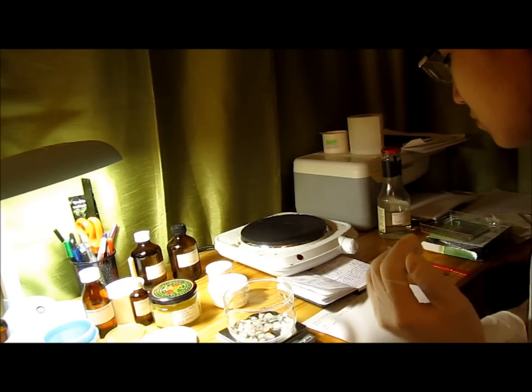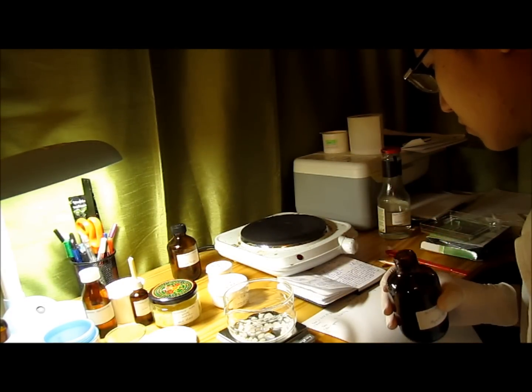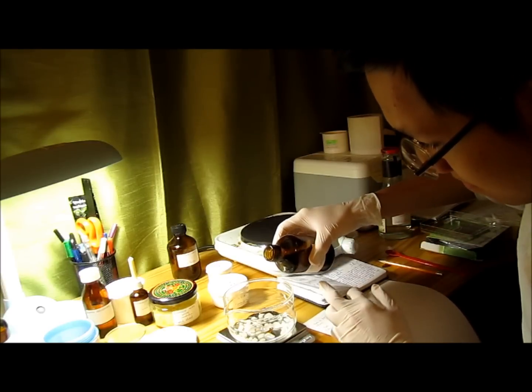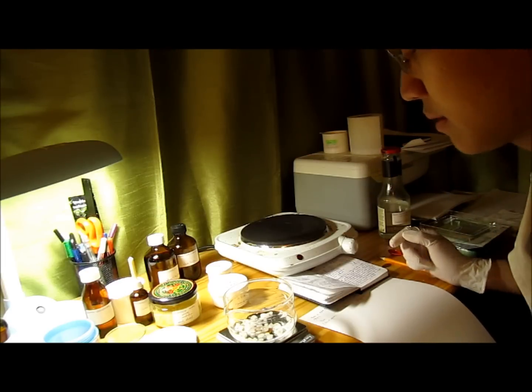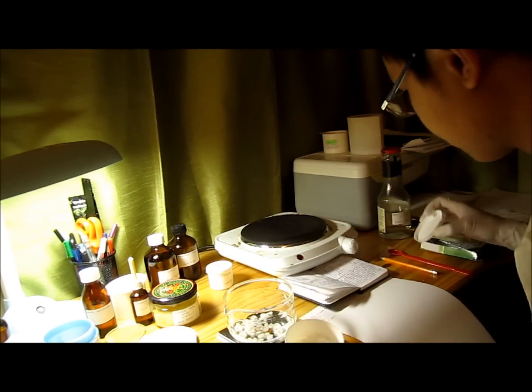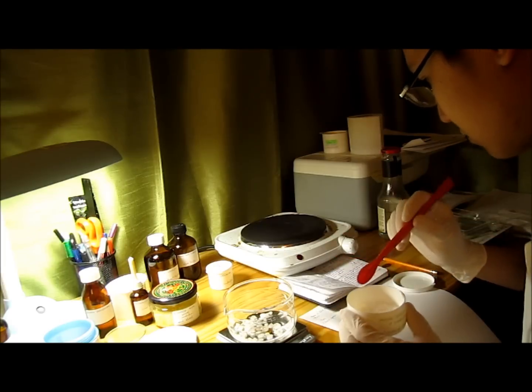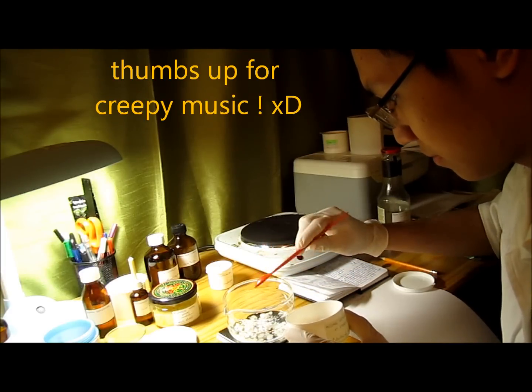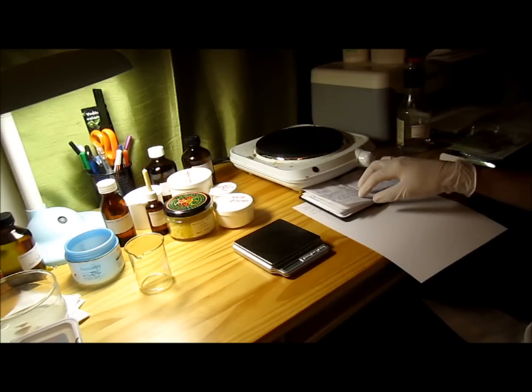The next thing is glycerol — we need 5 grams. And then cetostearyl alcohol — here we need 8 grams. So these four components I have to melt together on the electric hot plate. You can see here it's still very hot and everything is dissolved, so I let it sit on top of the table, protected.